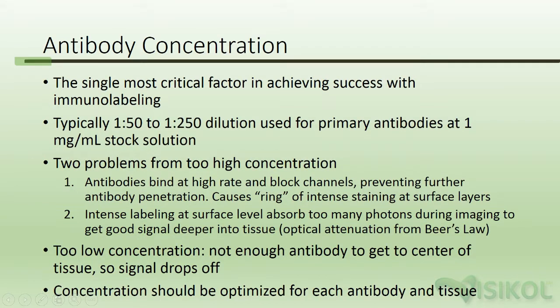Antibody concentration. The most critical factor for achieving success with immunolabeling is the antibody concentration. Typically, good results are obtained using a 1:50 to 1:250 dilution for primary antibodies that come in a 1 mg/ml stock solution. There are two problems caused from using too high a concentration: the antibodies bind at a high rate, blocking channels in the outer layers of tissue, which prevents further antibody penetration. This causes a ring of intense staining at surface layers.